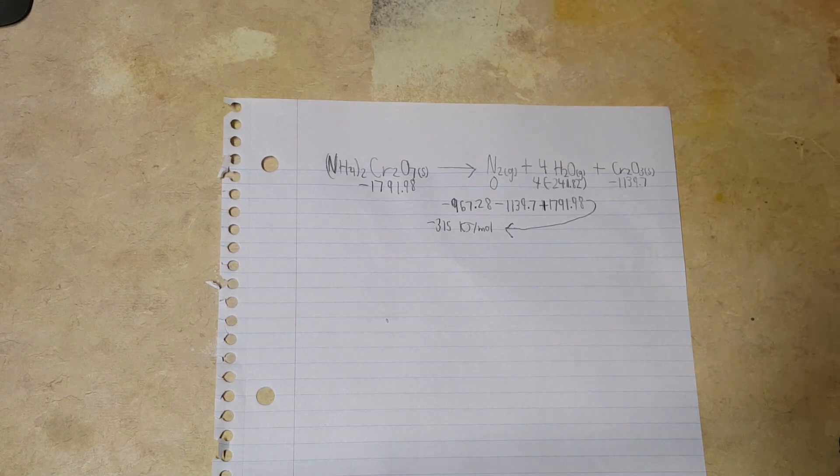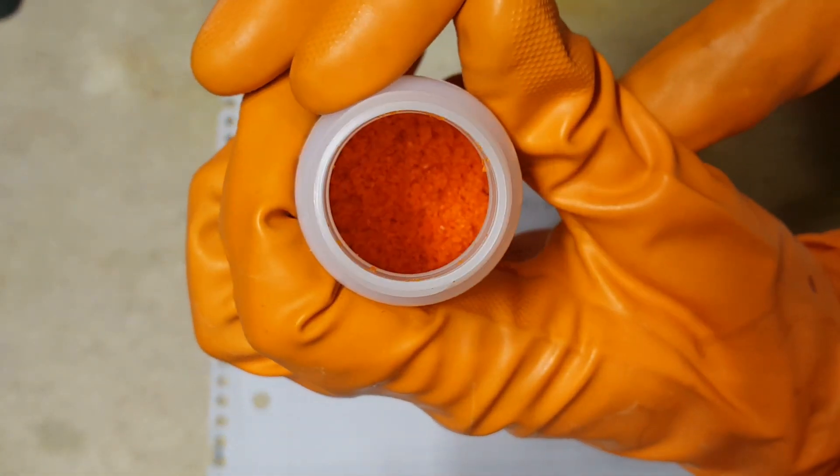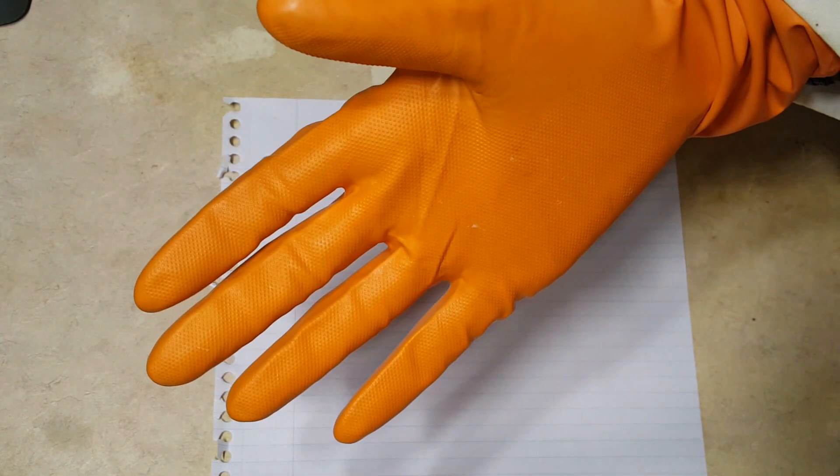Let me show you the ammonium dichromate. It is this orange salt right here. Now a few things about safety before we actually start the reaction: ammonium dichromate is toxic and carcinogenic, so you're going to want to wear gloves when you're handling it.